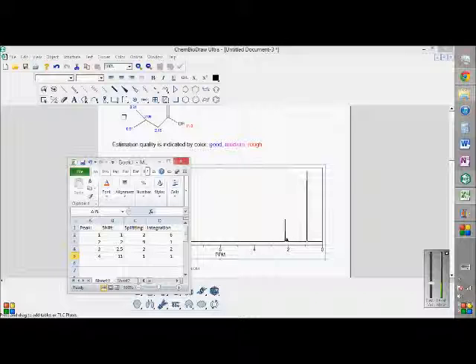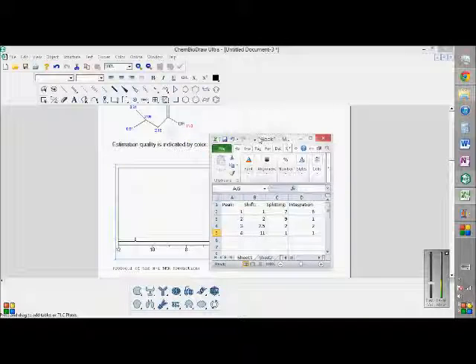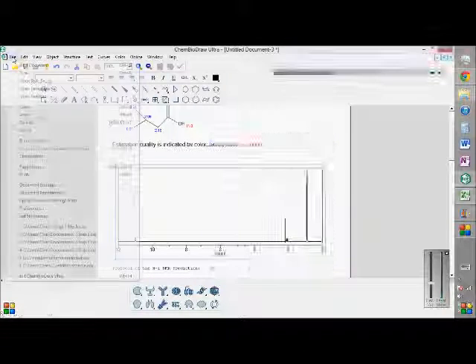This next one, because it was closer to this carbon double bonded to an oxygen, was a little bit farther down, and that belongs to this peak right here, as predicted. The final one has a very, very far shift because, as we said, it belongs to an oxygen. It's a very useful lab technique that I think is invaluable for anyone that wants to do any form of synthesis or purification.